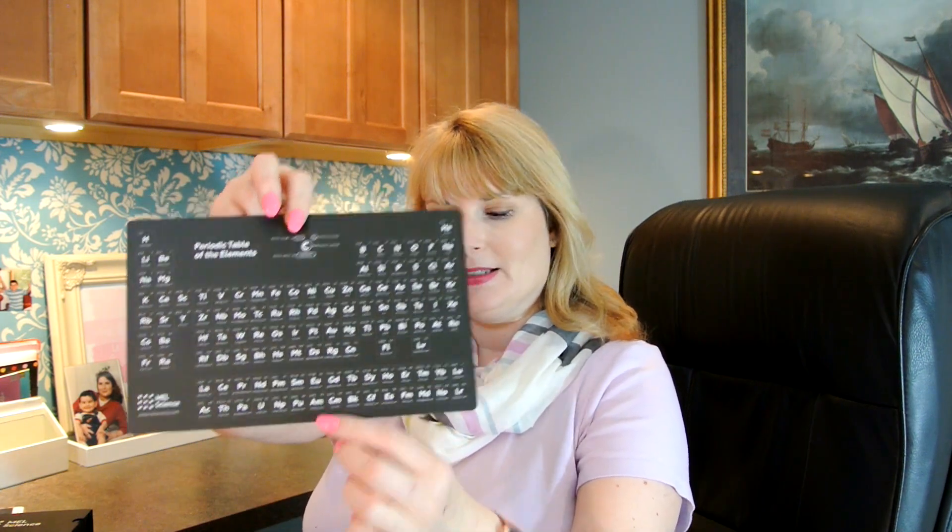In the first box, it is jam packed full of things. I find right off the bat the periodic table of the elements. And then you have a booklet — inside it says welcome to the exciting world of chemistry, safety, before you start. So basically it is instruction manuals: why learn chemistry, experiment cards, general guidelines. Any information you could possibly have will be addressed in the booklet.